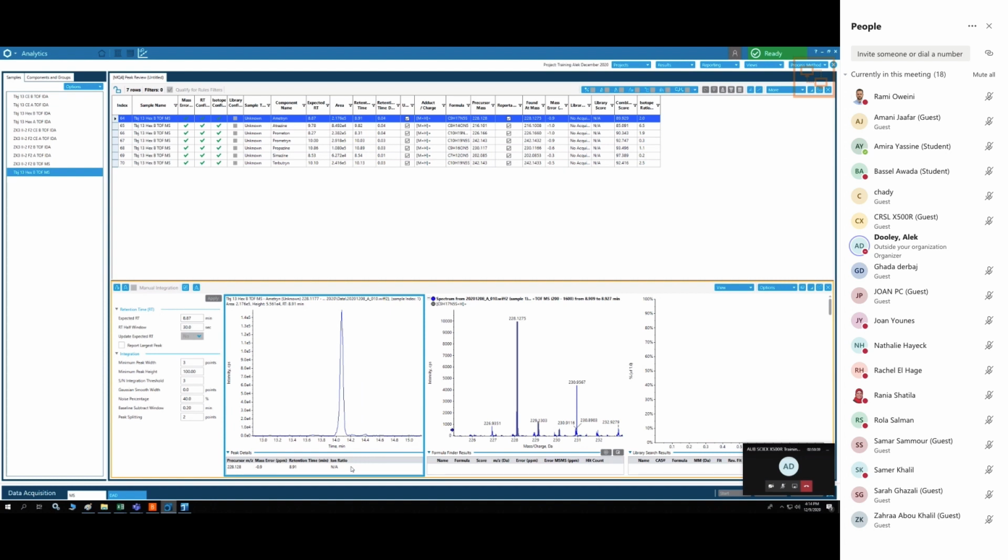It's not mixed up A and B, is it? Make sure that you have pump A and that it has the water on it, and pump B has the organic. And the solvent selection valve is correct, right? It has the LED. Channel A is on the left and channel B is on the right of the two LEDs. Yes, definitely, it is correct. It's on the right. Okay.